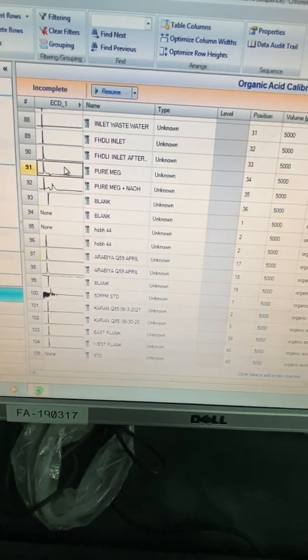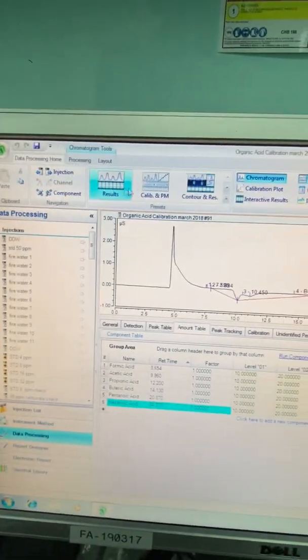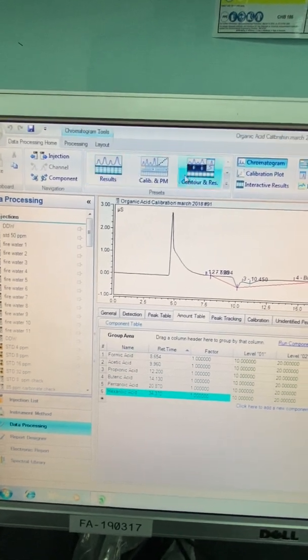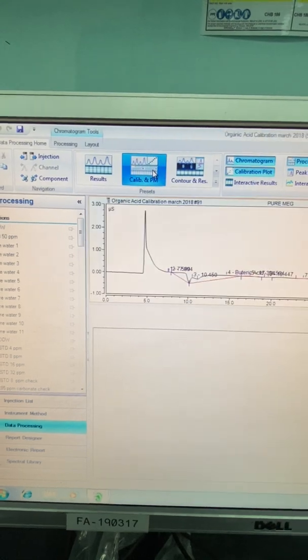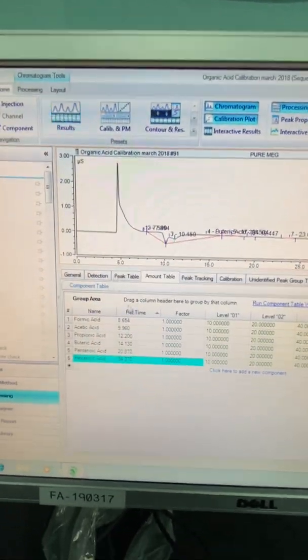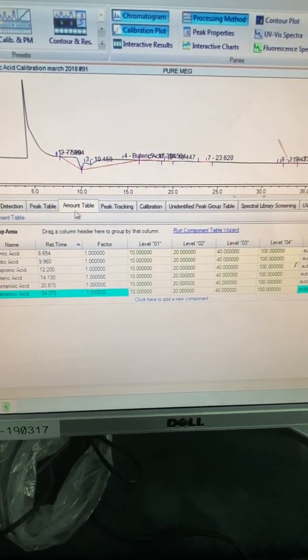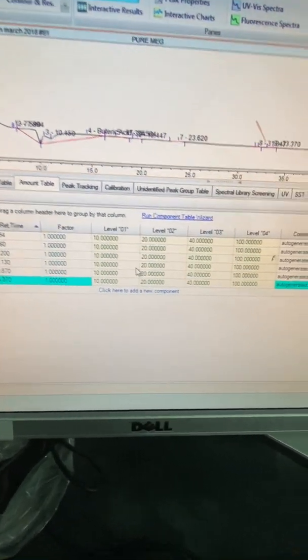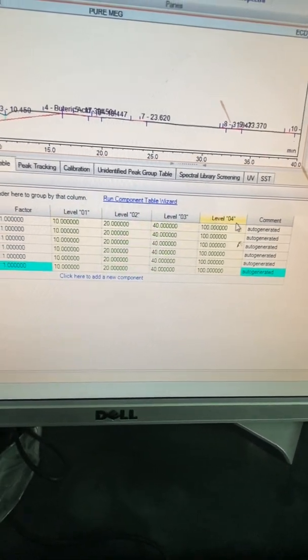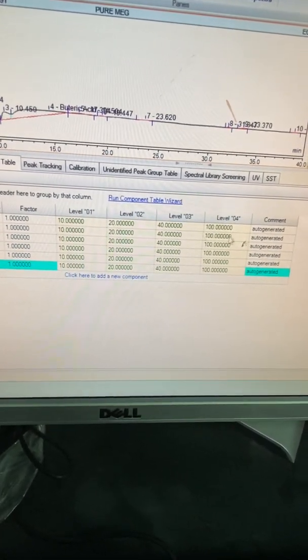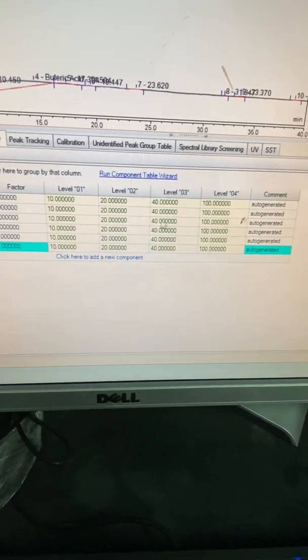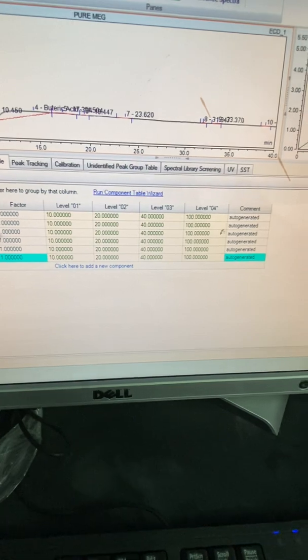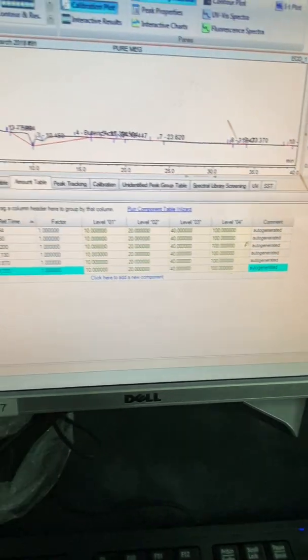Now consider I have already my own method. But I want to see the calibration. In the top, there are some options. Or here, calibration. Once you press the calibration, all the information will come here. You have to mention, this is the amount table. It's indicating here how many levels you have. The concentration of each level you will put here. 10, 20, 100 in ppm and the concentration. First of all, once you make your run, you have to identify the peaks.